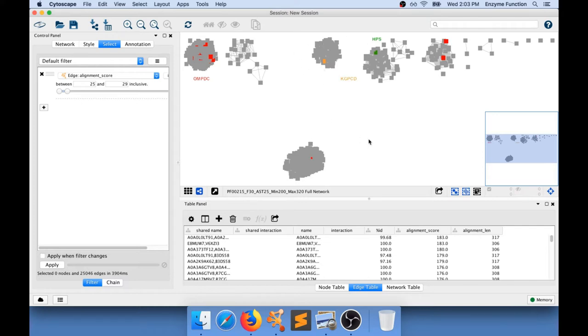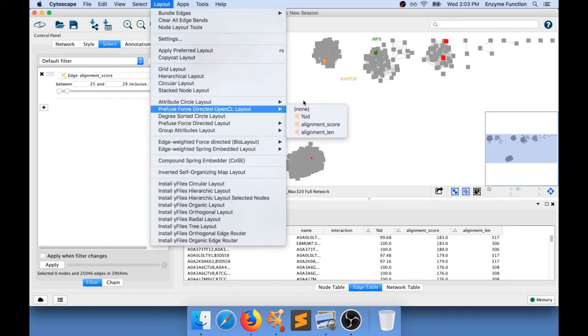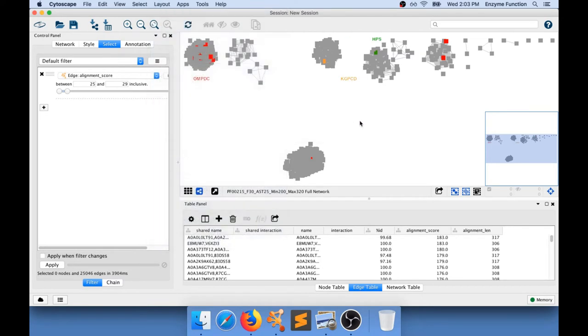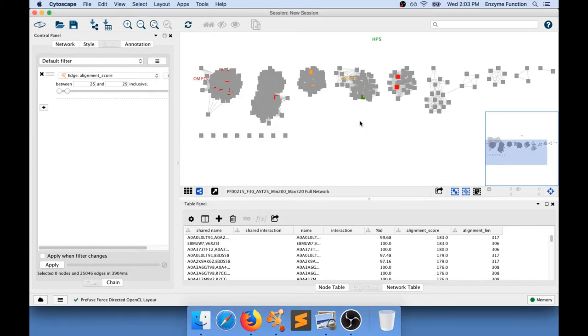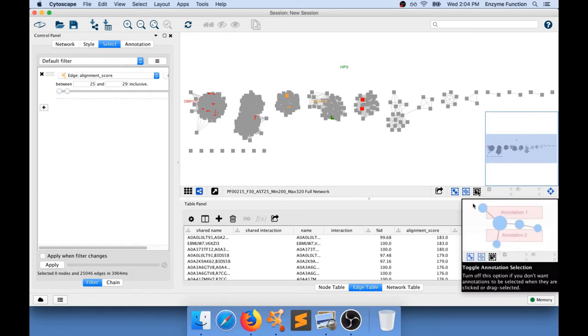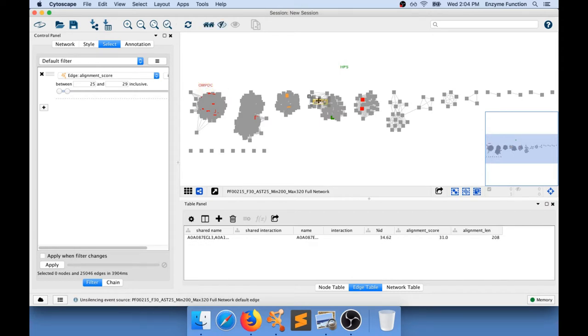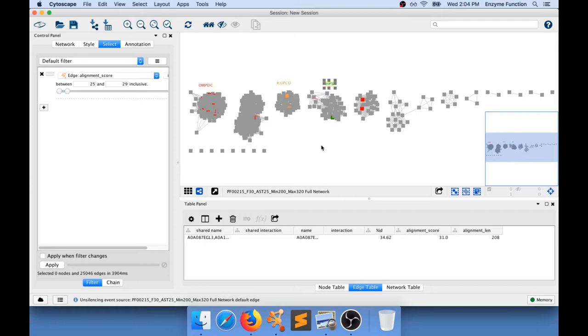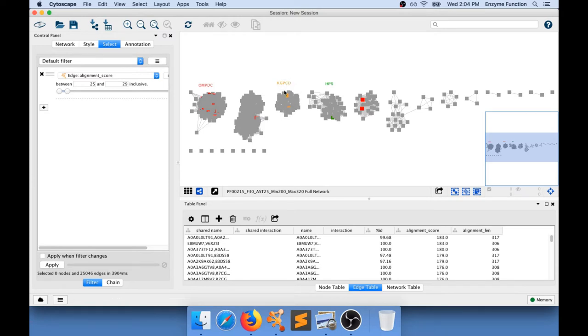When you manipulate your network you always need to reapply a layout. And because you reapply the layout the annotations are probably not going to be where they need to be. So you need to activate the annotation selection button. And you can now move the annotations where you want them to be. And now I have a network for which I have this SwissProt annotation that is not connected to that SwissProt annotation.